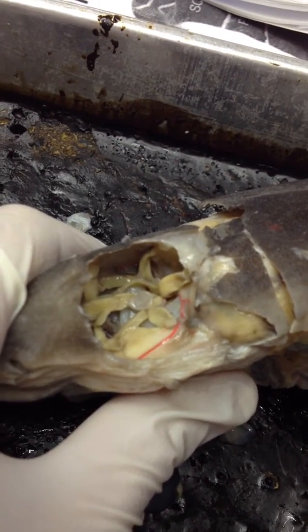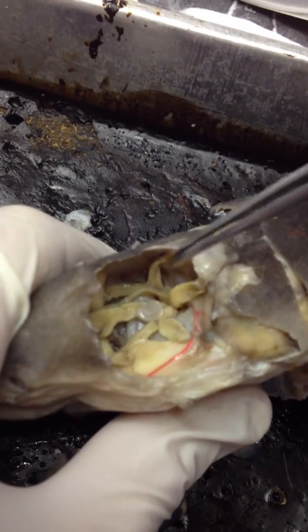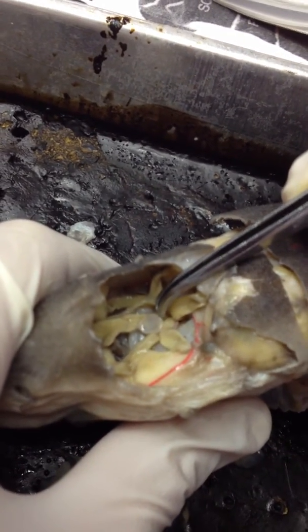This is the intraorbital muscles and nerves for the dogfish shark. We'll start here with the optic pedestal.